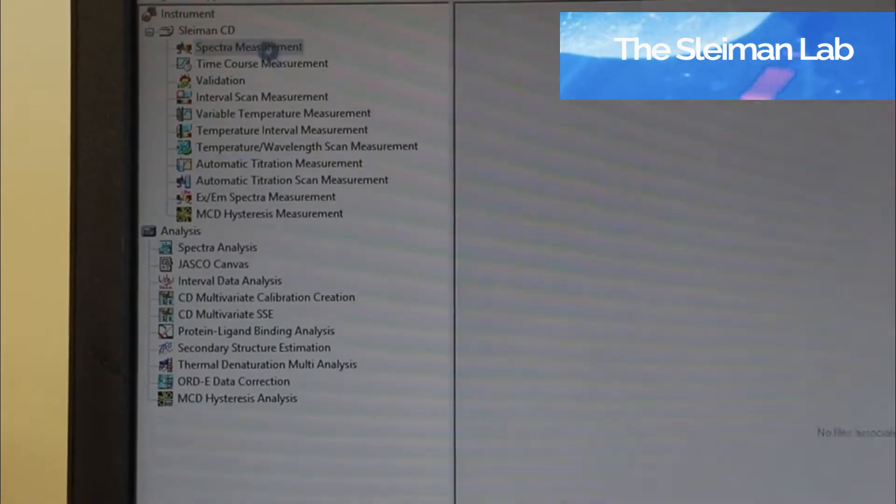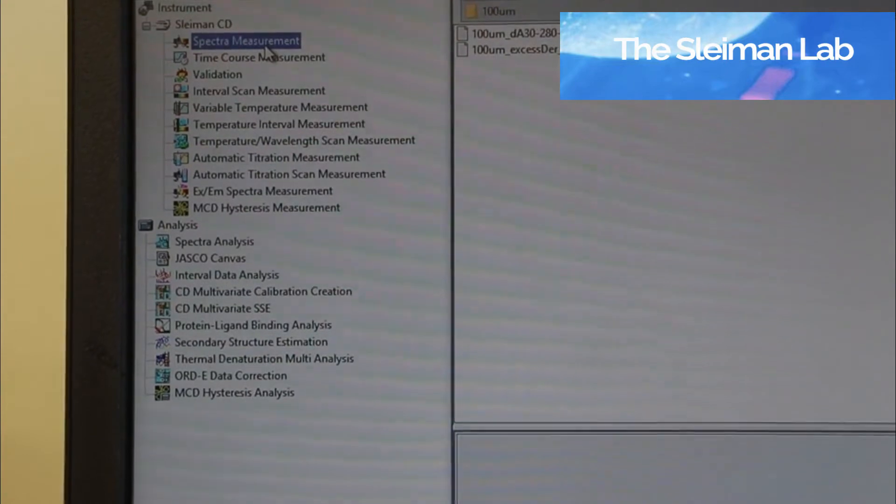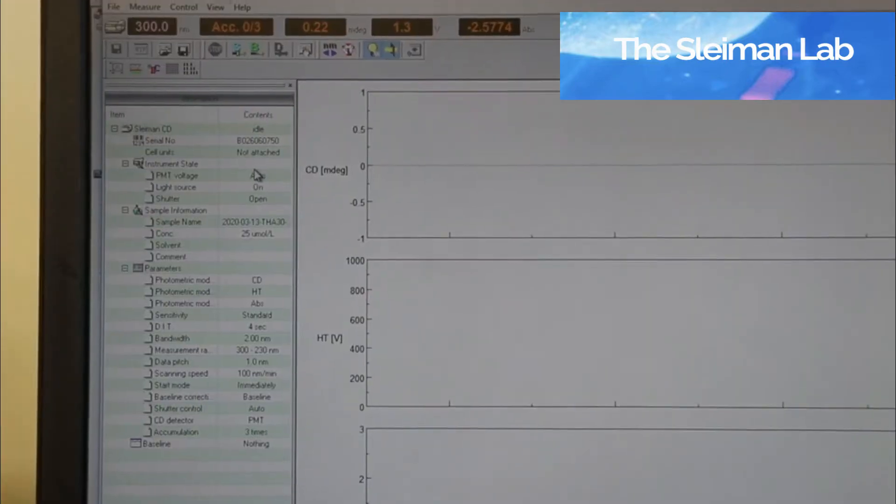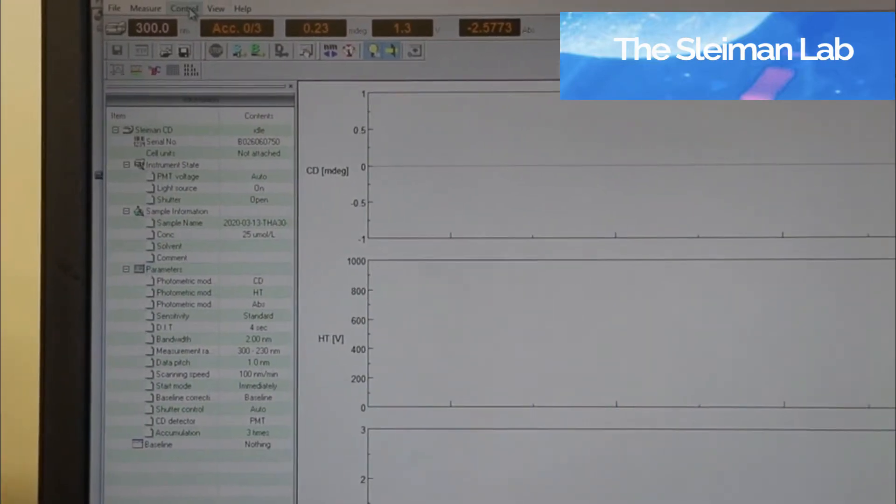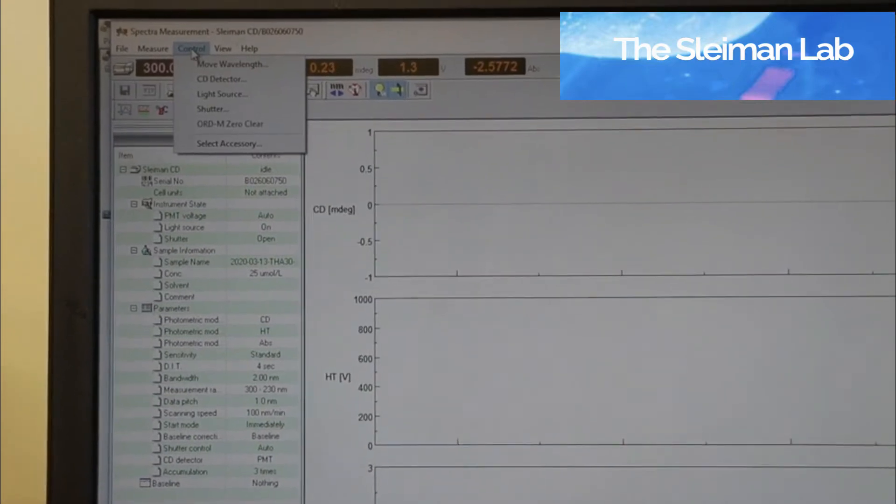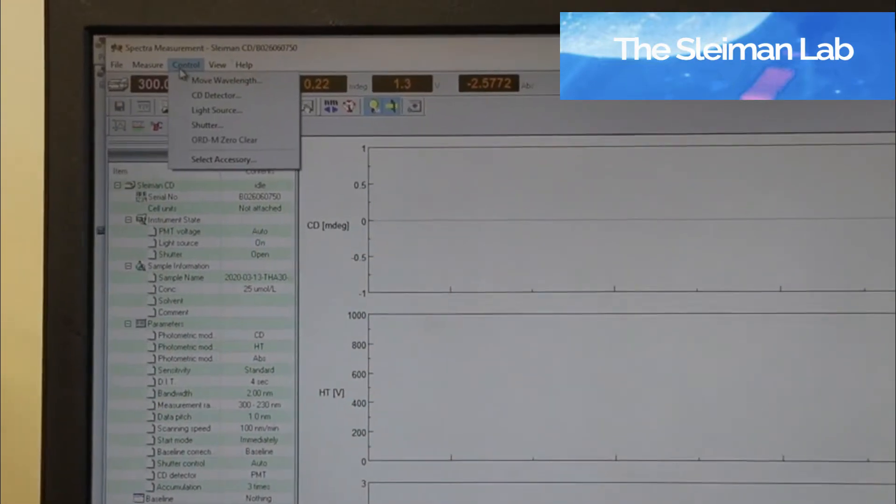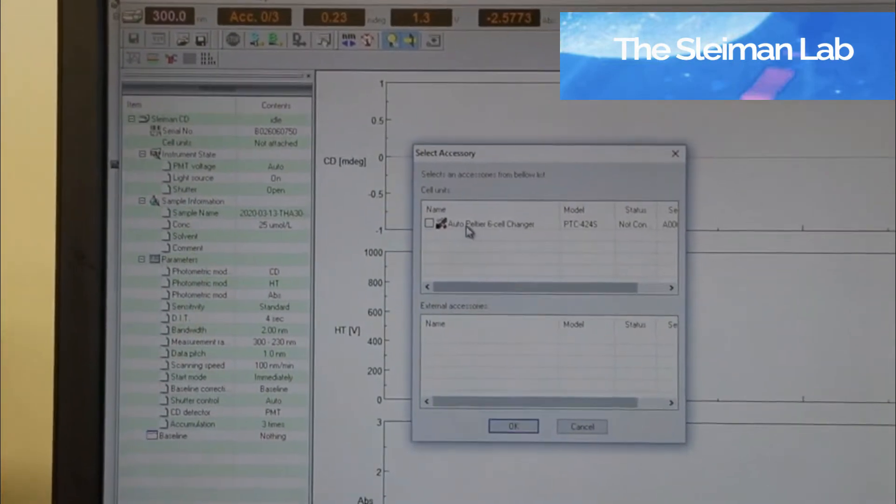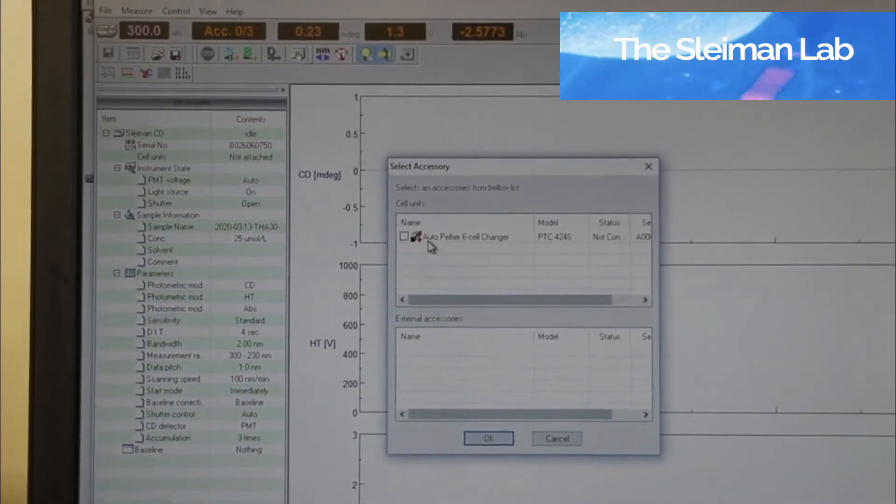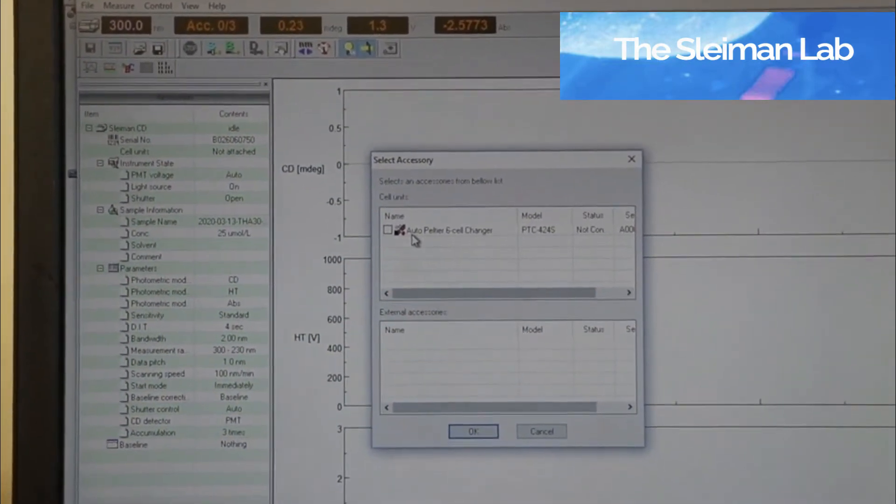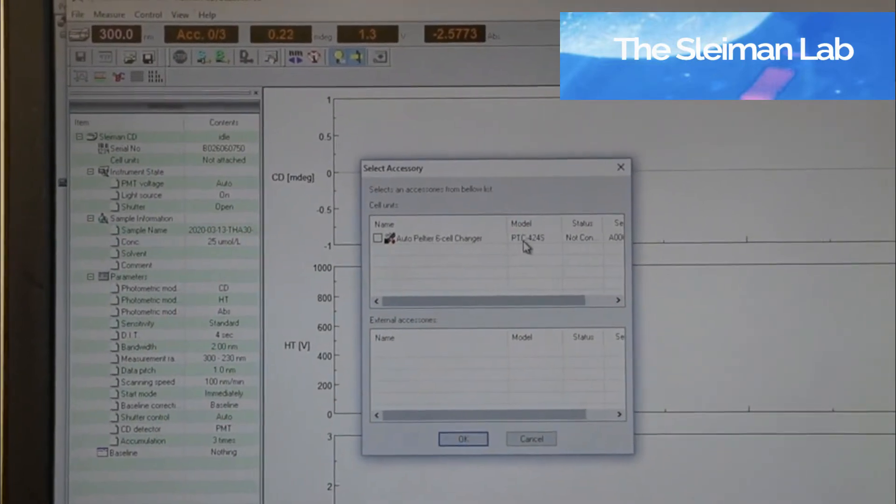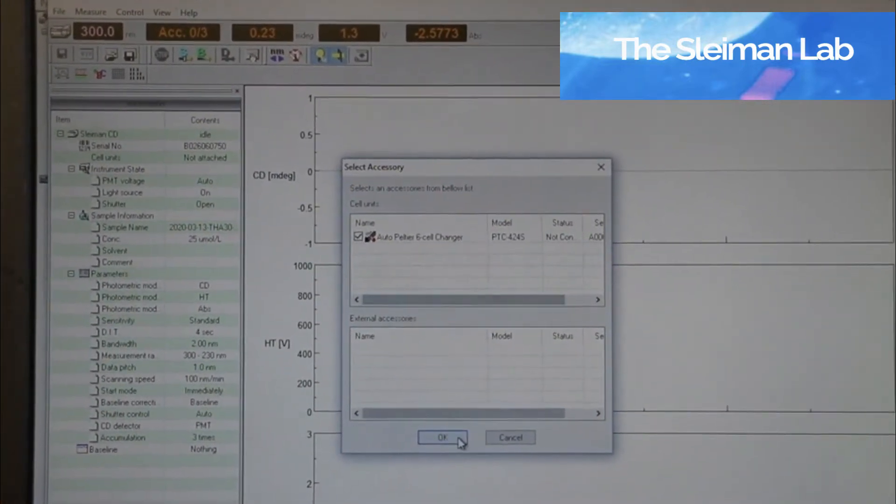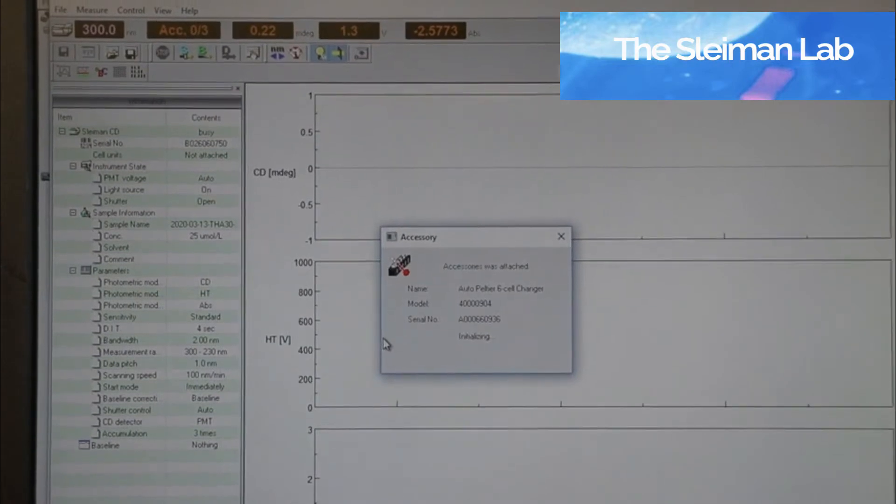We will start today with a simple spectrum measurement. The first thing you'll want to do is add the temperature controller. You go into Control, select Accessory, and if you've correctly connected your temperature controller, you will now have the Auto Peltier 6 Cell Changer, our model, and you're able to connect it.